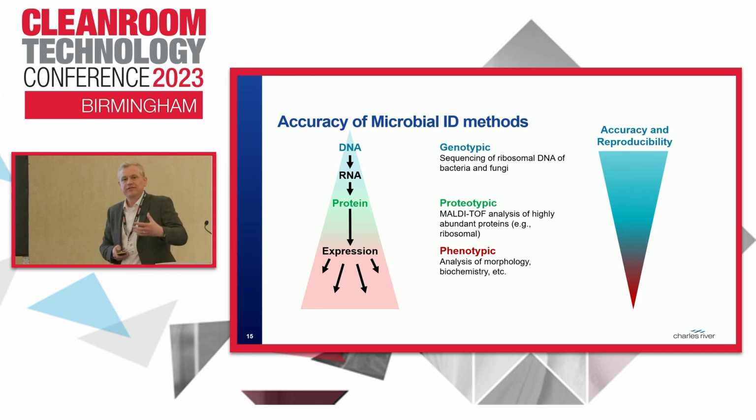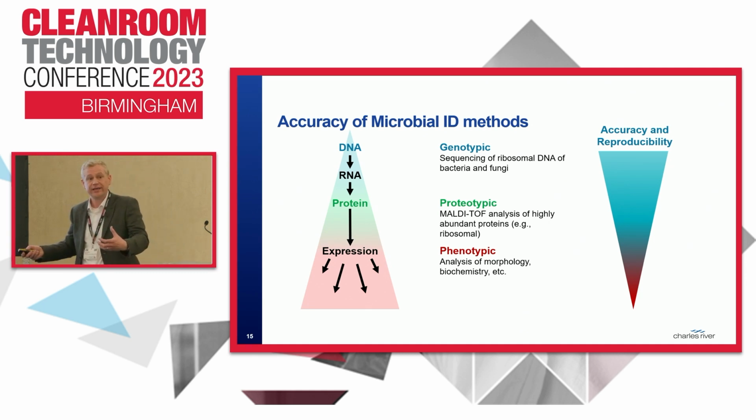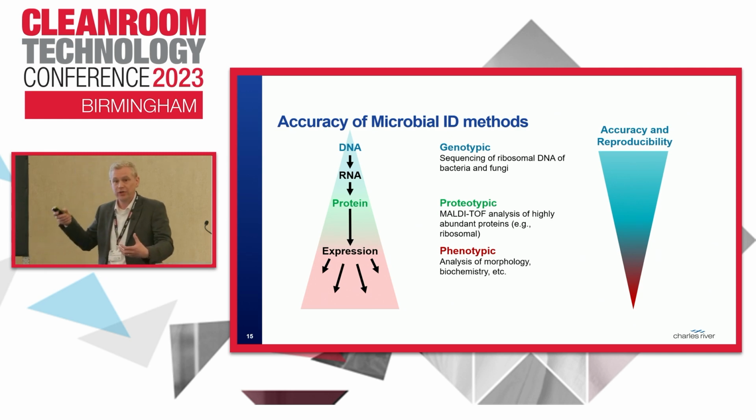So the gram stain is the first step in the process flow for that phenotypic method that customer used. So if they get the gram stain wrong at the start, they're always going to get the end result wrong at the end. Okay? There's no way to correct that. It's always going to give you a gram-positive result at the end.